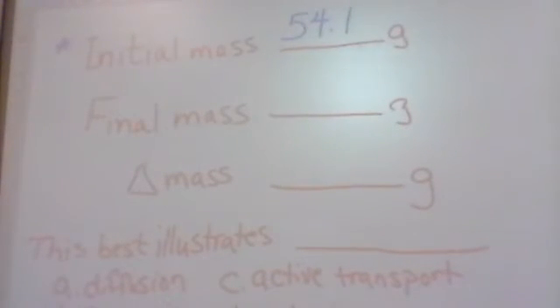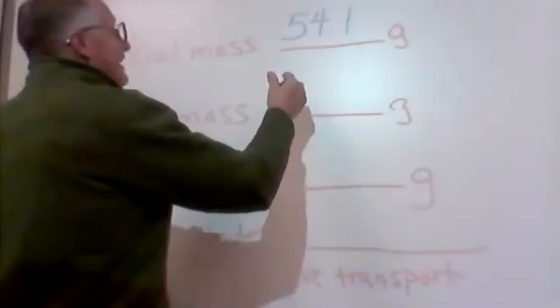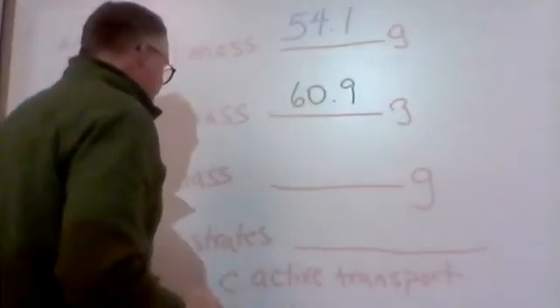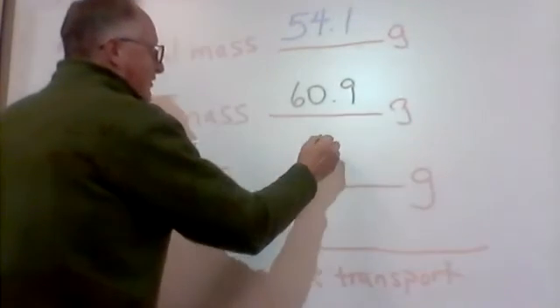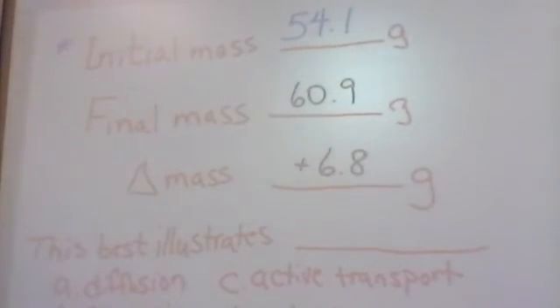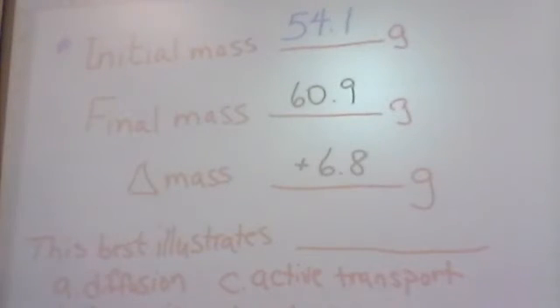All right, so they're measuring, and they came up with a mass of 60.9. So the change, we could do that, plus 6.8, I think, if my math is correct. For those of you following at home, they are that fast at measuring.